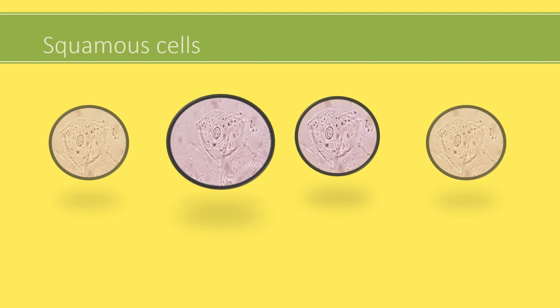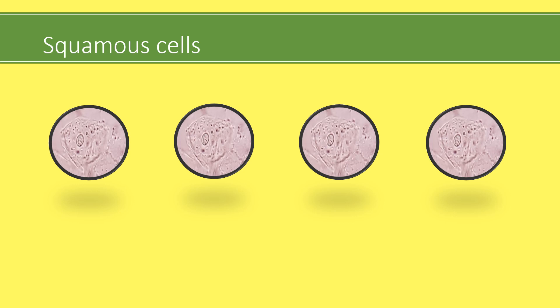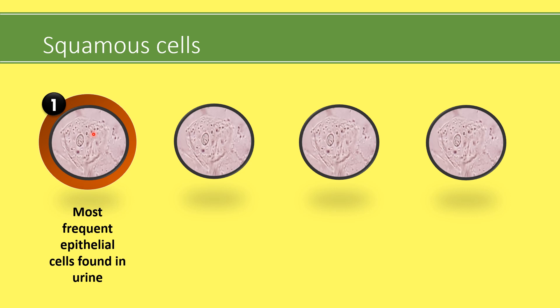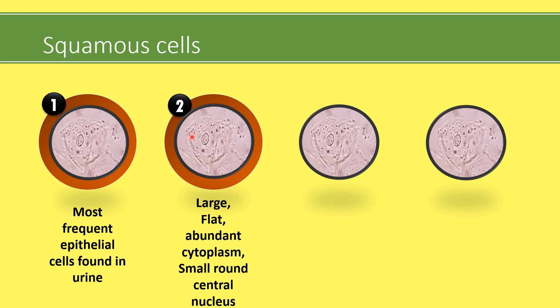Let's learn a few points regarding squamous cells. Why do you call these squamous cells? Because these are the most frequent epithelial cells found in urine. Look at the structure — these are large flat cells with abundant cytoplasm and small round central nucleus. The margins are also folded in some cells. This structure resembles squamous cell morphology.